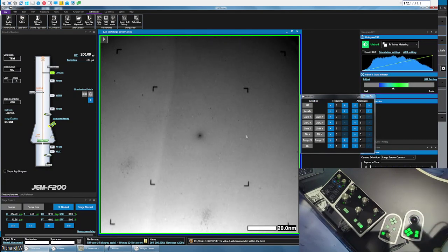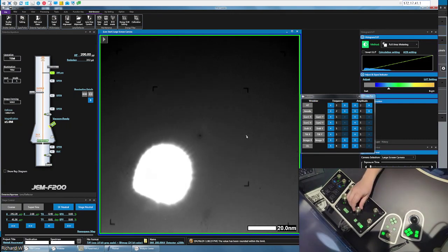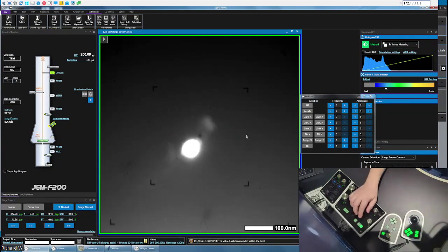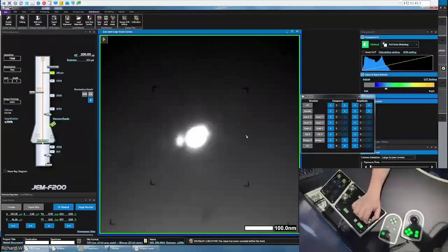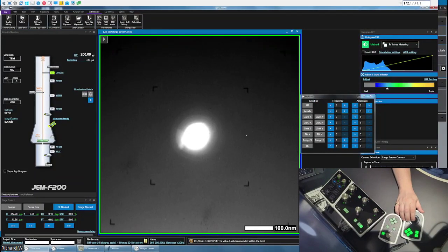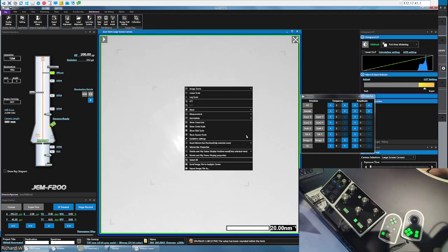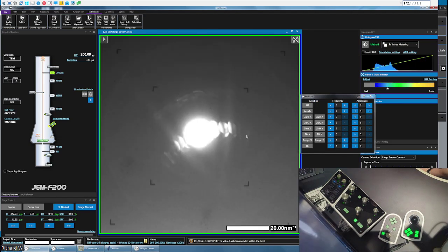So we want to orientate the sample. I'm just going to decrease the magnification slightly and center the beam. We're going to use convergent beam diffraction to orientate the sample. If we converge the beam using the brightness knob on the left-hand side, we can go to diffraction now, and if I change this to linear scale, that might make it easier to see.